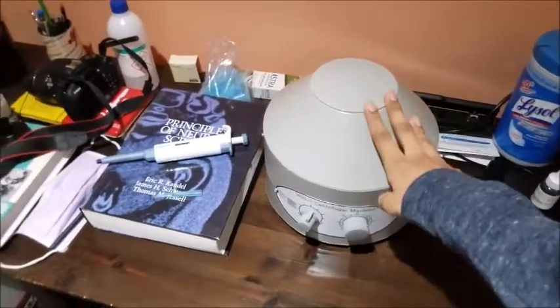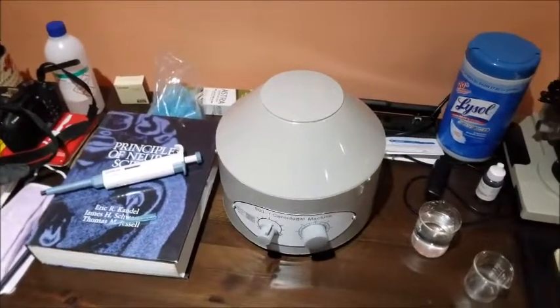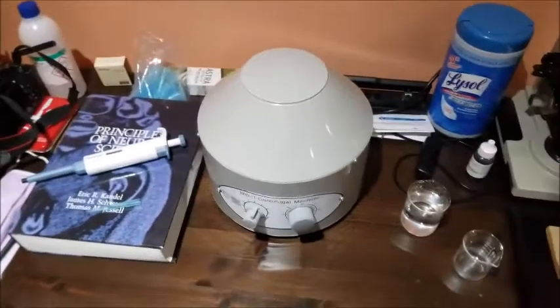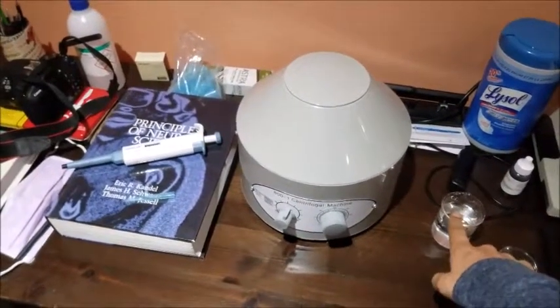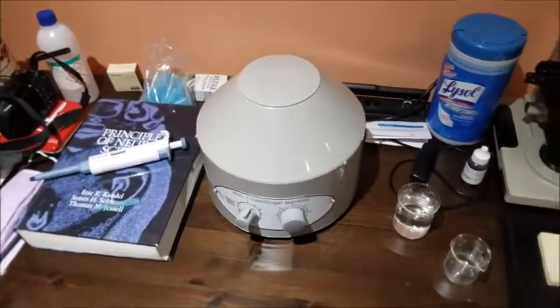This video is going to be a tutorial on using a centrifuge. This particular one is a benchtop centrifuge, but the procedures are relatively similar for all types of centrifuges. Obviously you're going to need some sort of material to centrifuge, so in this case we're just doing a trial with water.